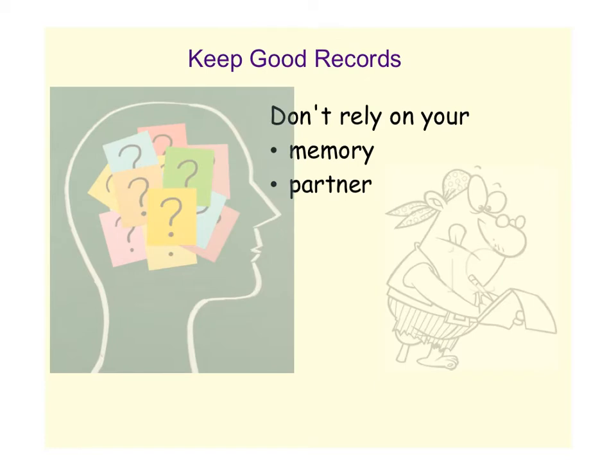Now, when you're doing this lab, it's a long lab. This is a multi-day lab. So it's going to be very important that you keep good records. Don't think, oh yeah, I'll remember tomorrow that I was on step 4. Make sure that you're writing down where you're stopping every day so you know where to pick up and start. We also recommend you don't stop mid-step, that you complete a step before you stop, because it can kind of skew your results if you don't do that.